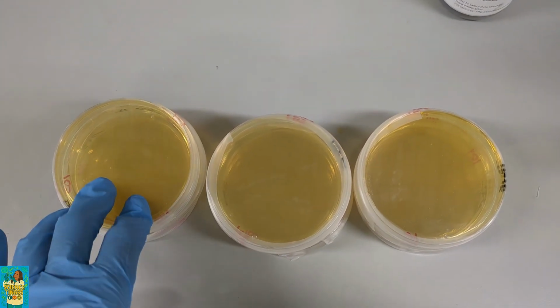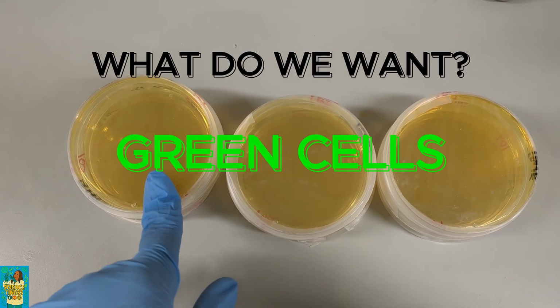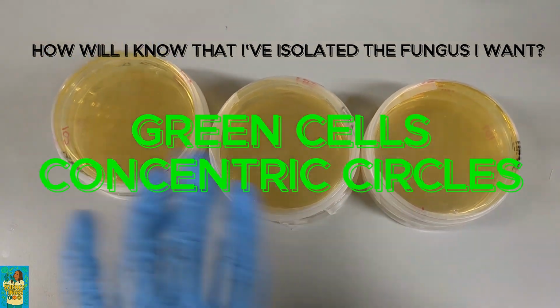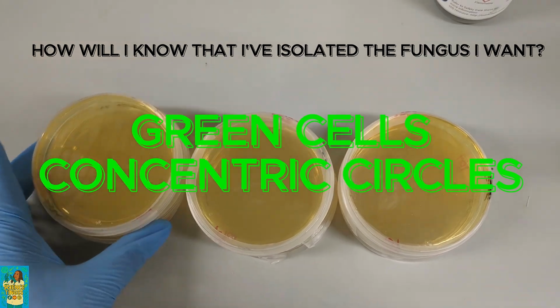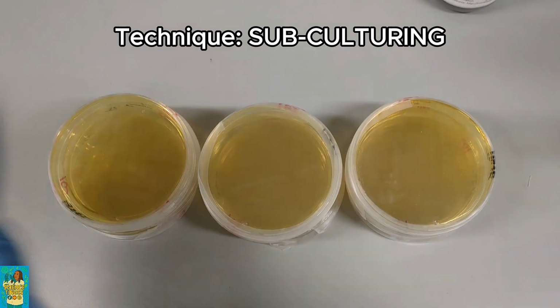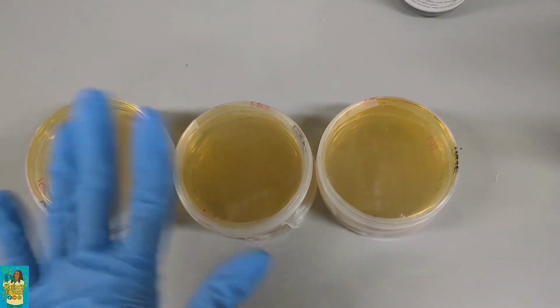The growth that I want should grow green, and as they get bigger, they should form concentric circles. But I'm looking for green growth. And once I have green cells, then I'll take a little piece of it and streak it onto a new empty media of the same type.